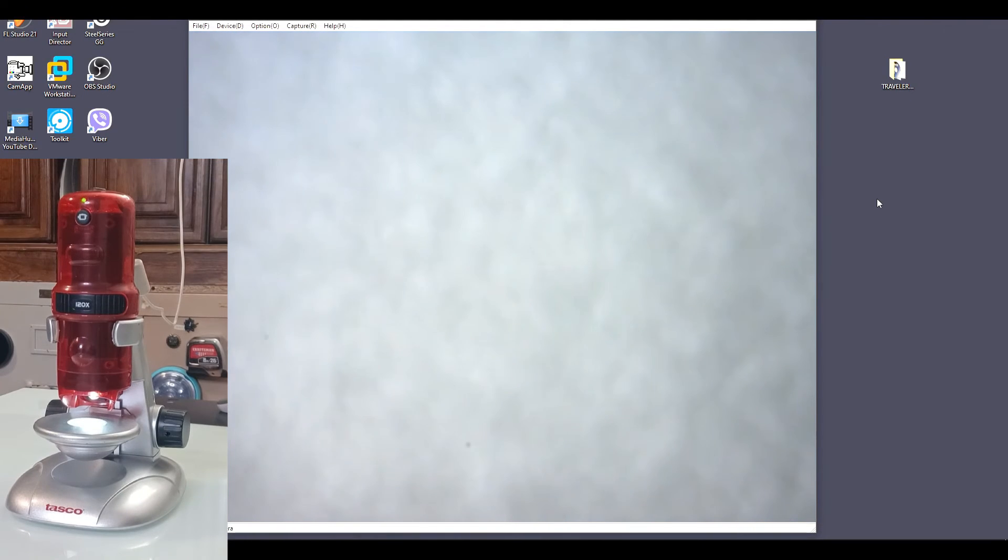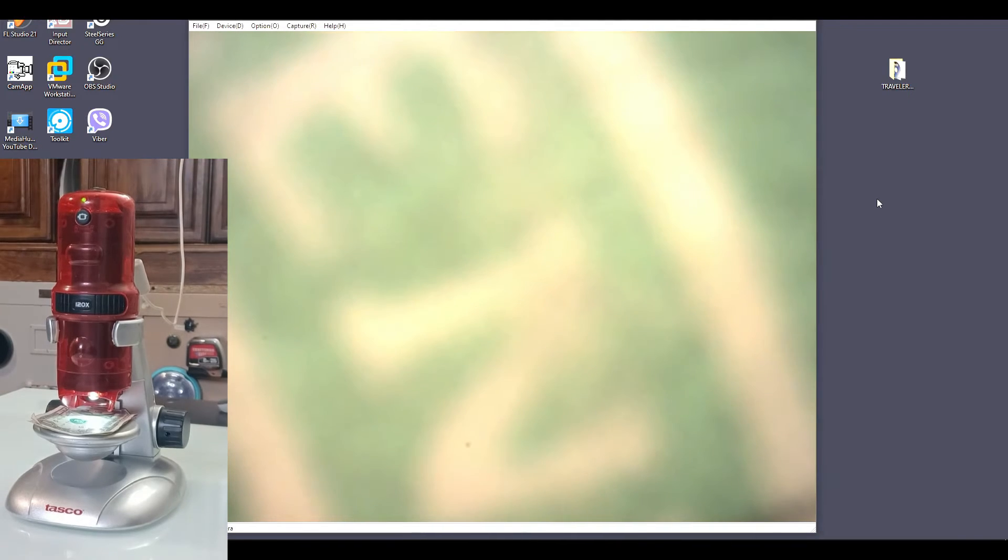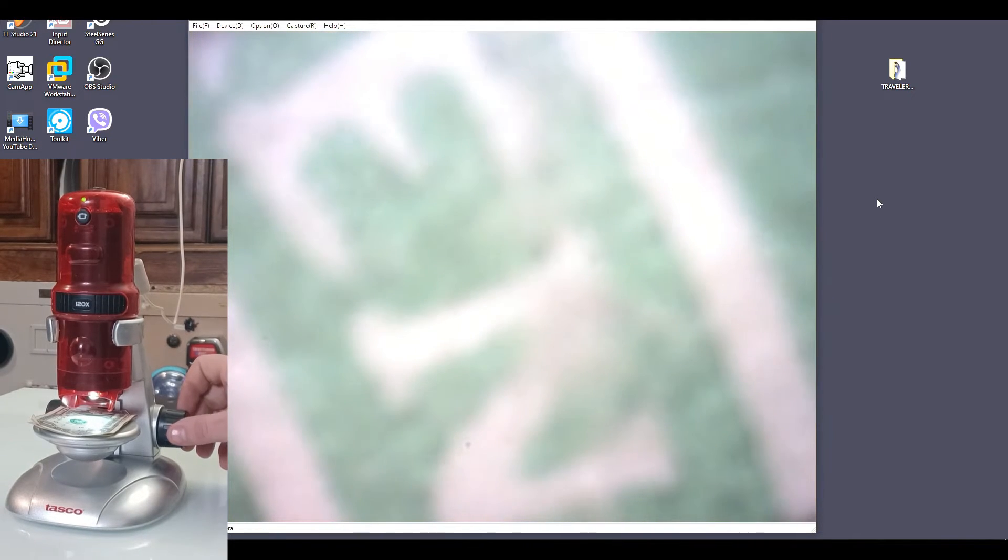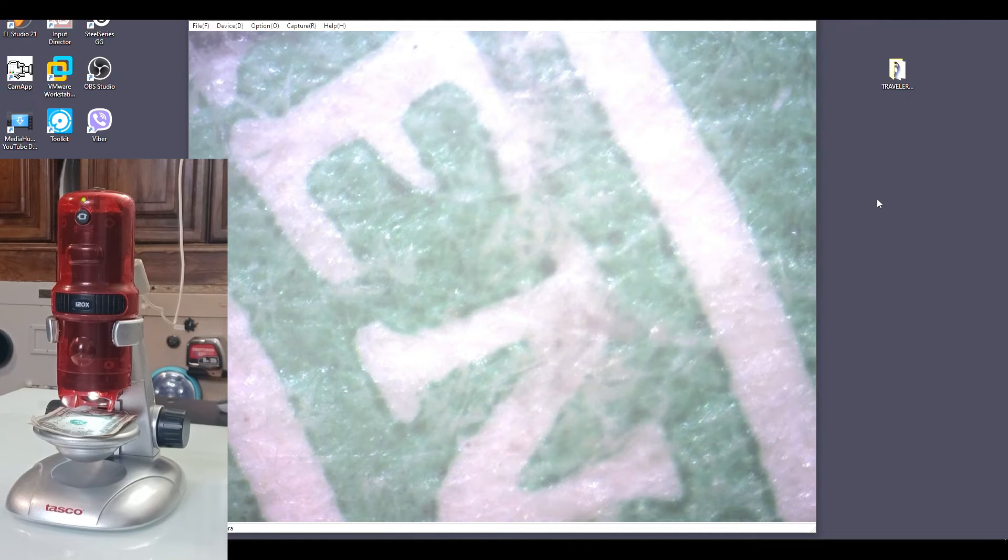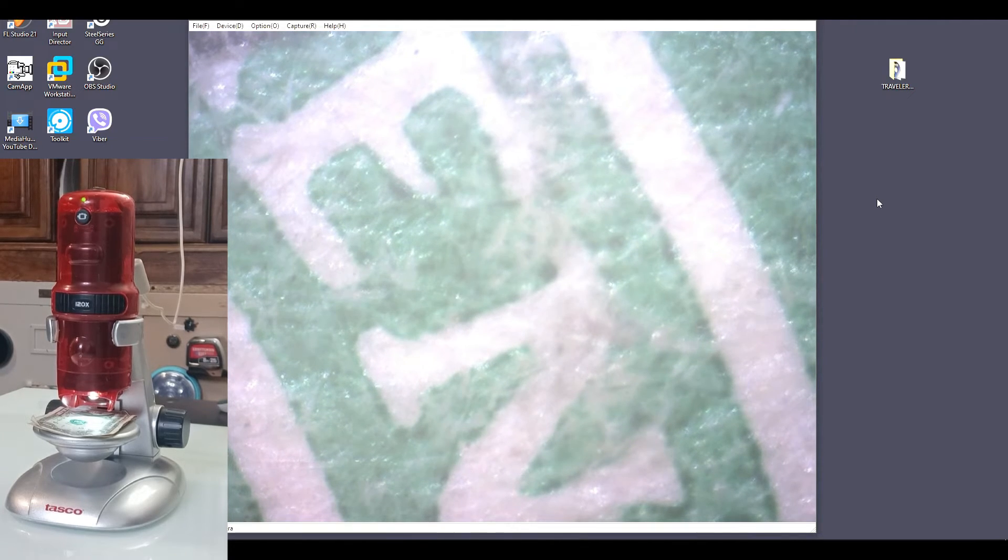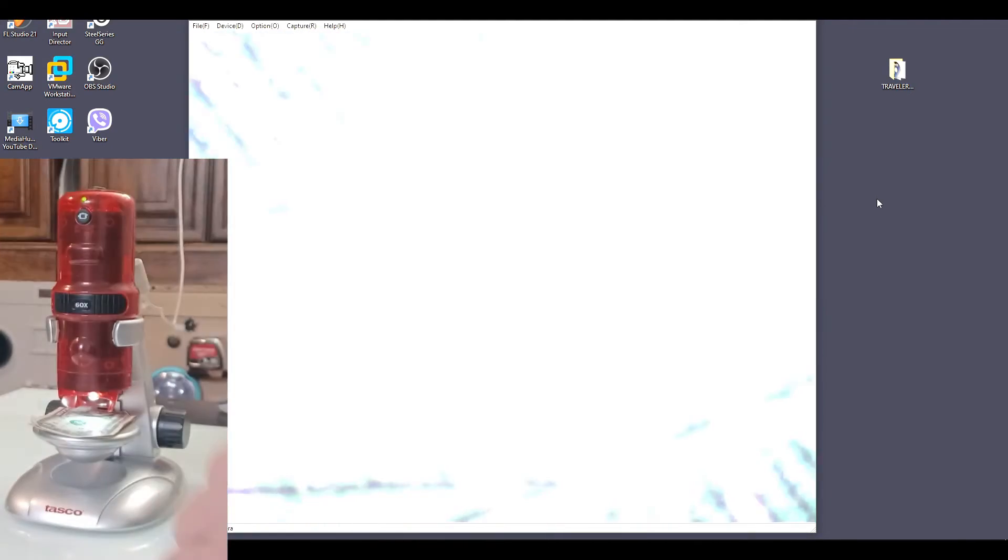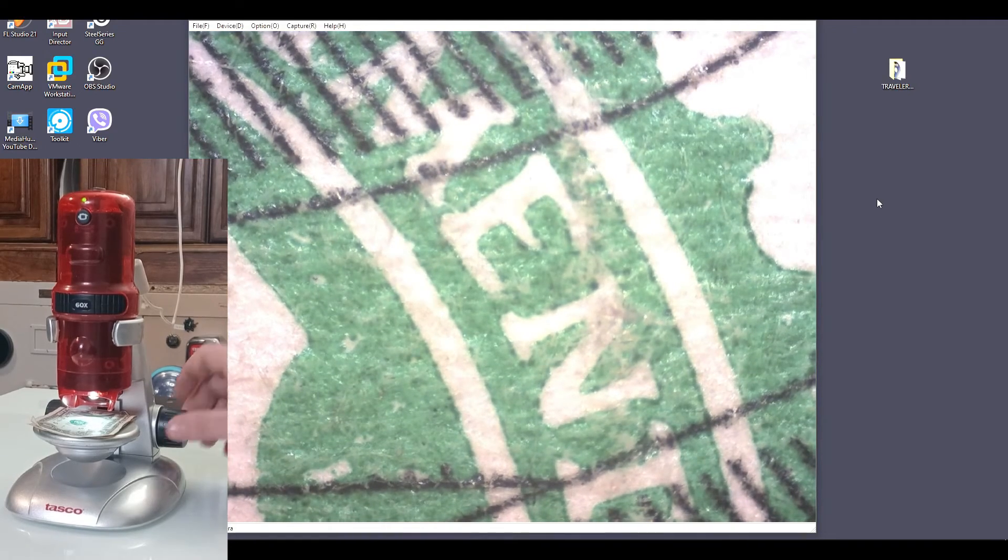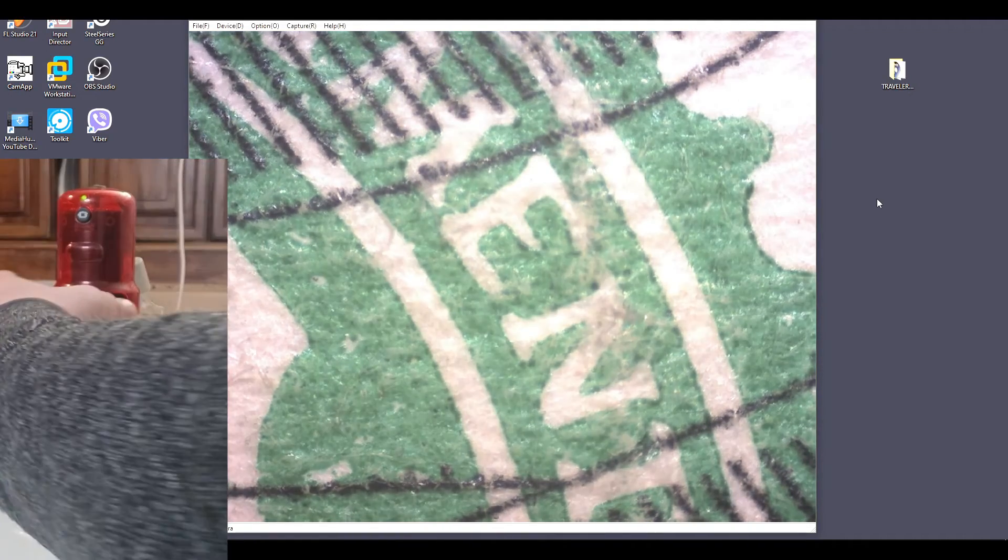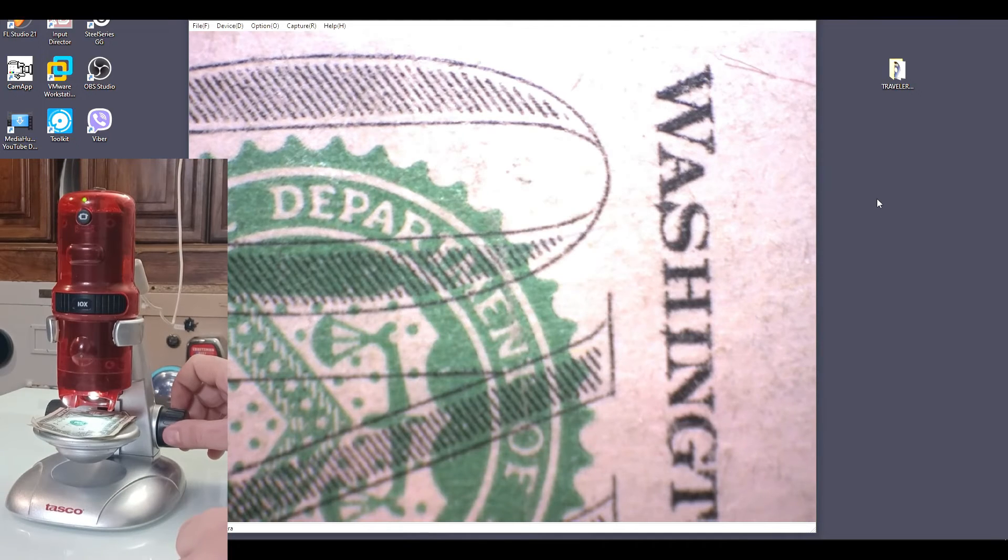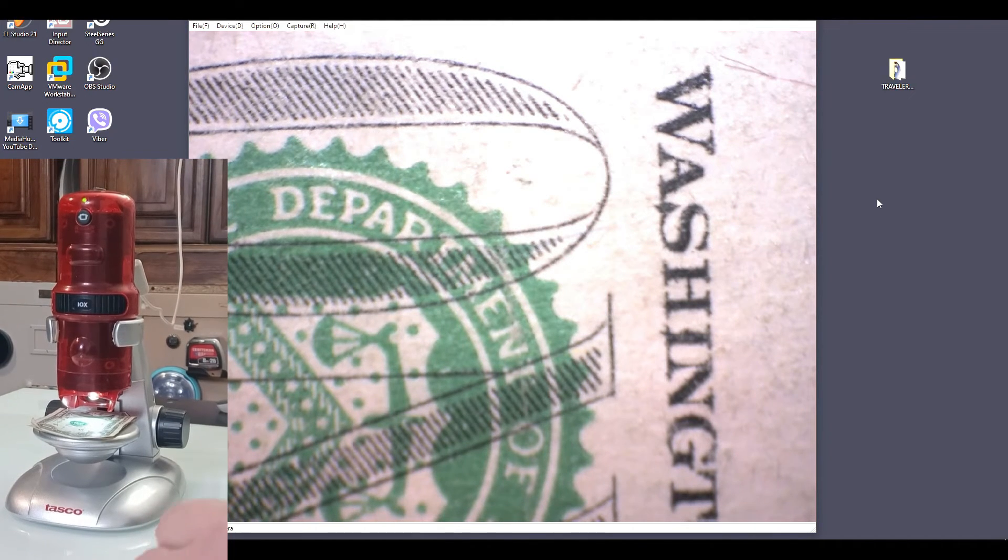Let me put, for example, a US dollar. This is a US dollar. It's on 120 right now. But as you see, you can see the fibers. Yes, US dollar is not made of paper, it is fiber. Let me drop it to 60 really quick. Let me clean it up a little bit. This is US dollar. Let me drop it to 10x, which is the normal. Clear it up a little bit. And here you have your microscope.